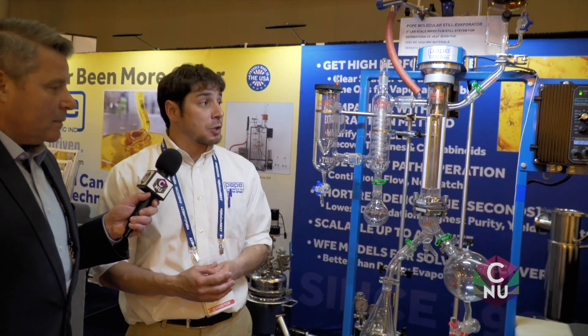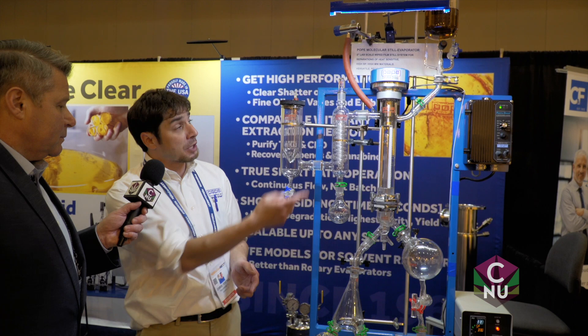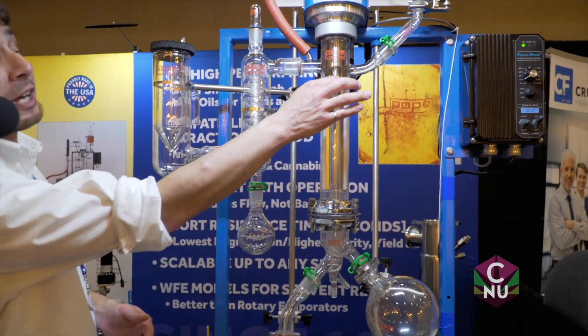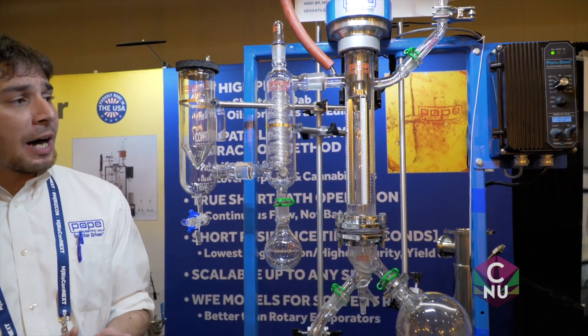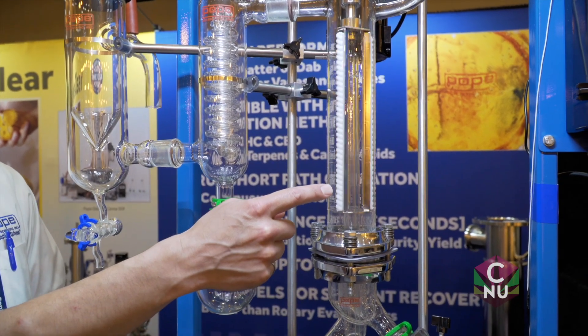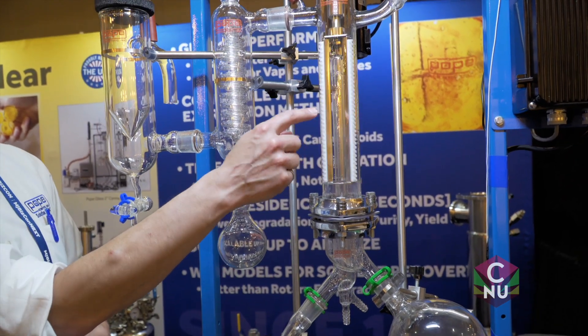For the layman like myself, what the heck's happening here? So what you've got, basically, is distillation equipment that's designed for high molecular weight, heat-sensitive materials. Cannabis happens to be both. So the technology itself is what we call short-path distillation, and what happens is your material starts off at the top and comes down the wall. There would be a heater here normally — we removed it so people can see inside the inner workings. Stuff that boils will boil off the wall and hit this condenser inside. This internal condenser is what makes this equipment short-path distillation. The vapor path from the heated wall to the condenser is short.